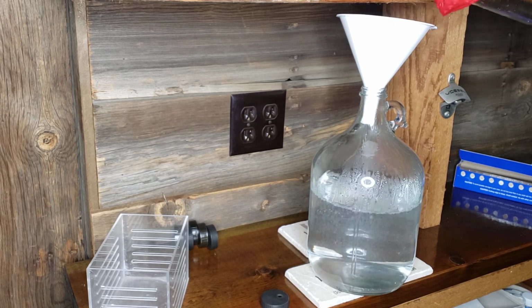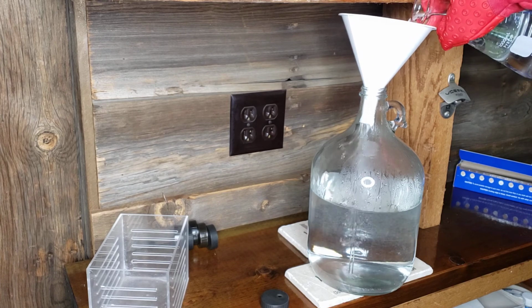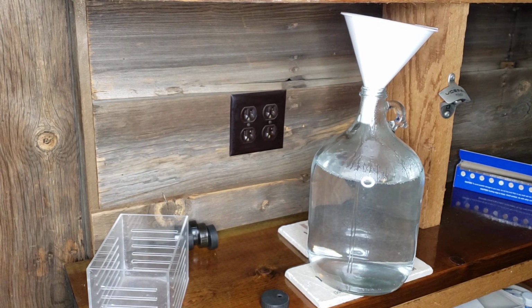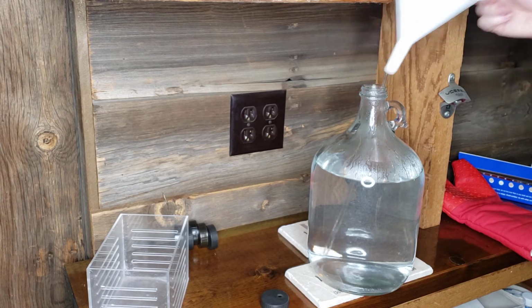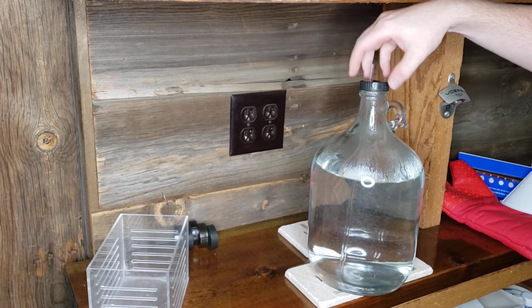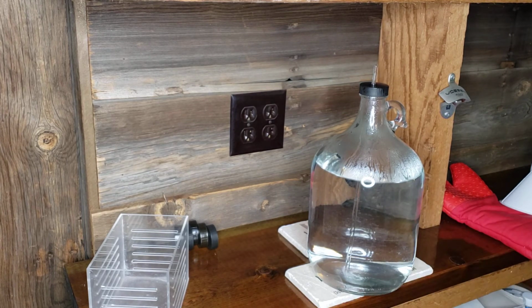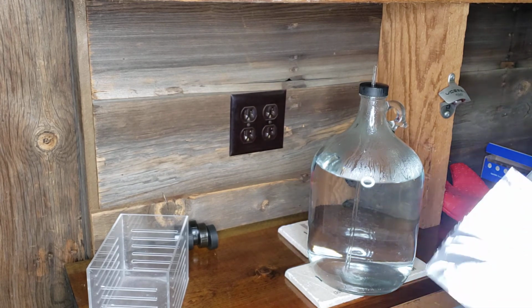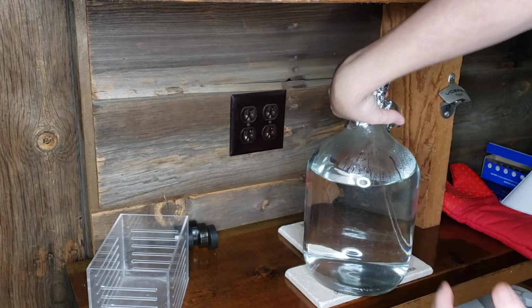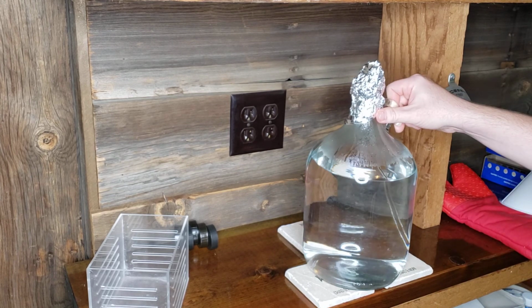So this water is heated to pretty close to boiling. So it's going to sterilize the inside of this gallon jug, so that we can avoid any contaminants. Just put the cap on. There we go. And what I do after this is I take some aluminum foil, wrap it on the top, try and get an airtight seal best you can. And that's it.